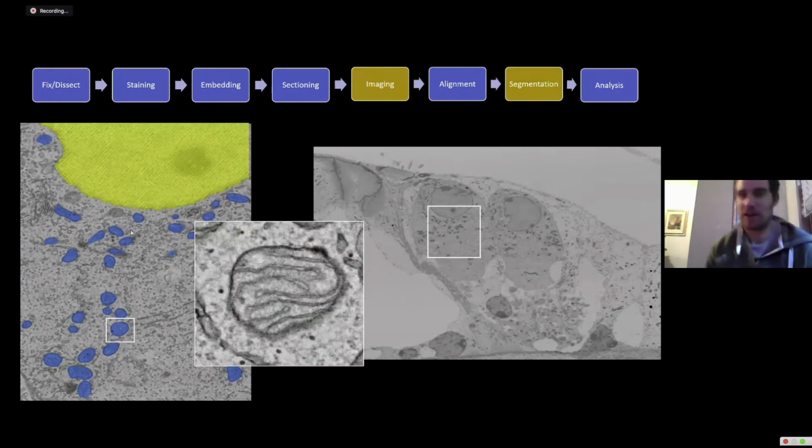And we can highlight all of the mitochondria here. And we can look at one in particular, and this is where energy is made and converted into usable energy for the cell. And as Uri demonstrated in his presentation, the mitochondria can respond to injury and they can respond to all kinds of conditions. And so understanding the distribution of mitochondria in a cell might be a really important question to ask.